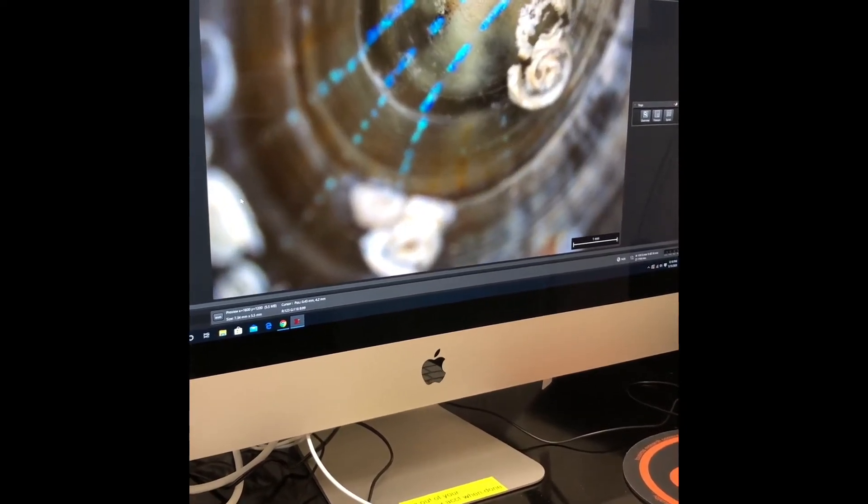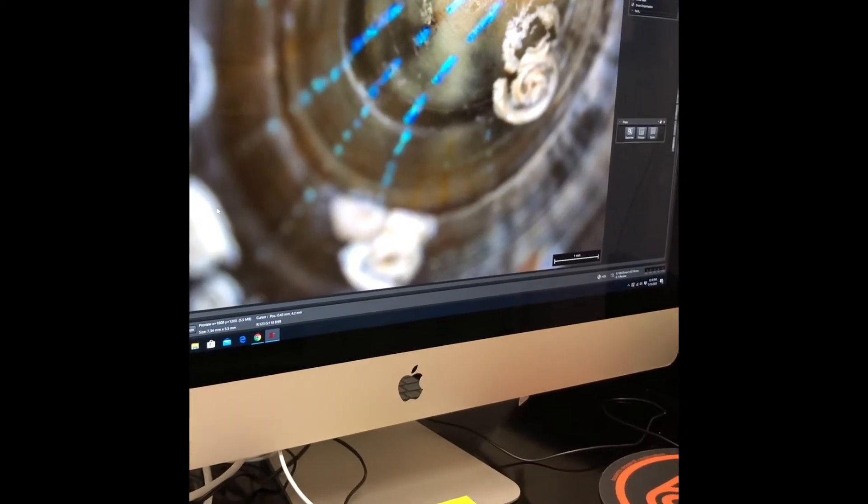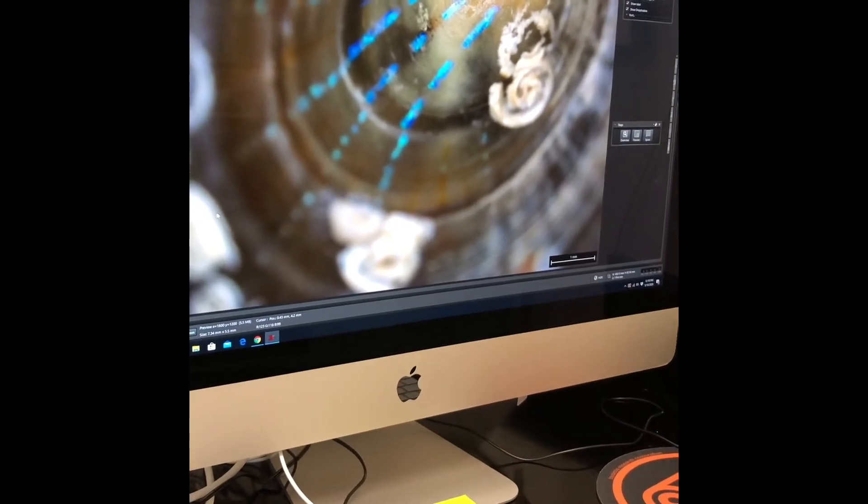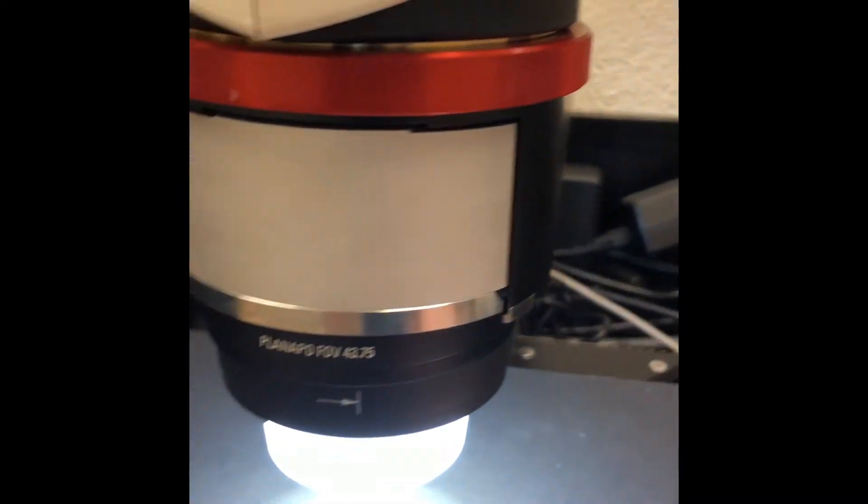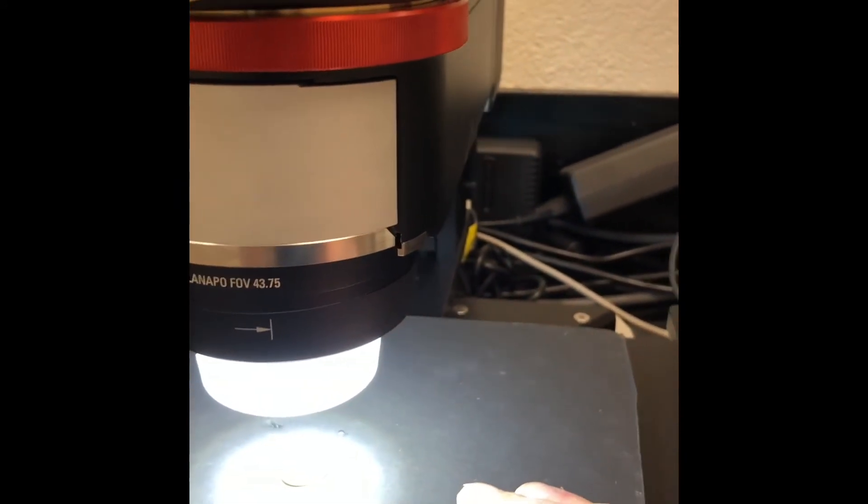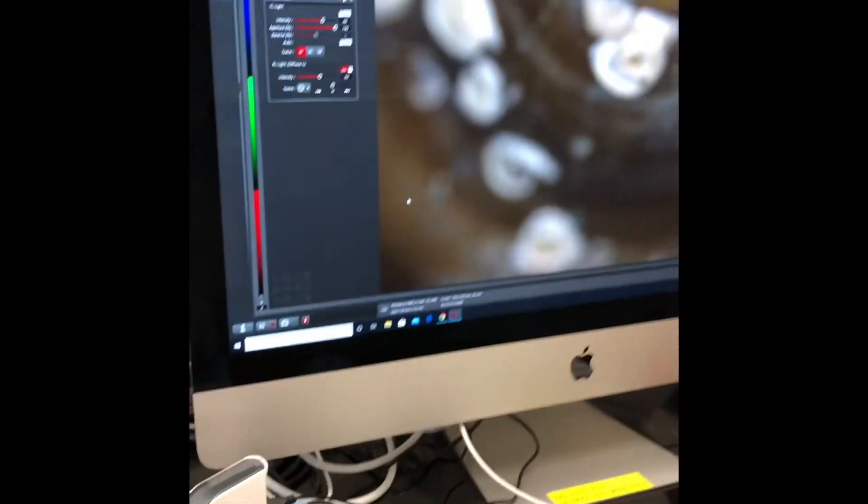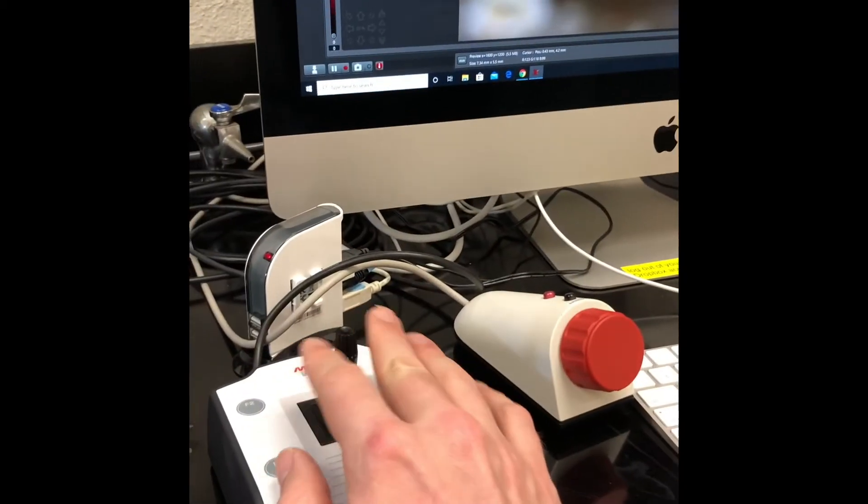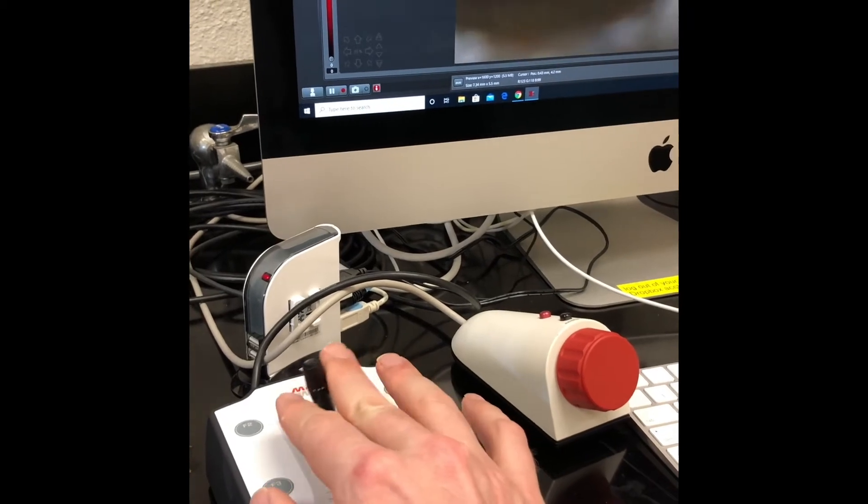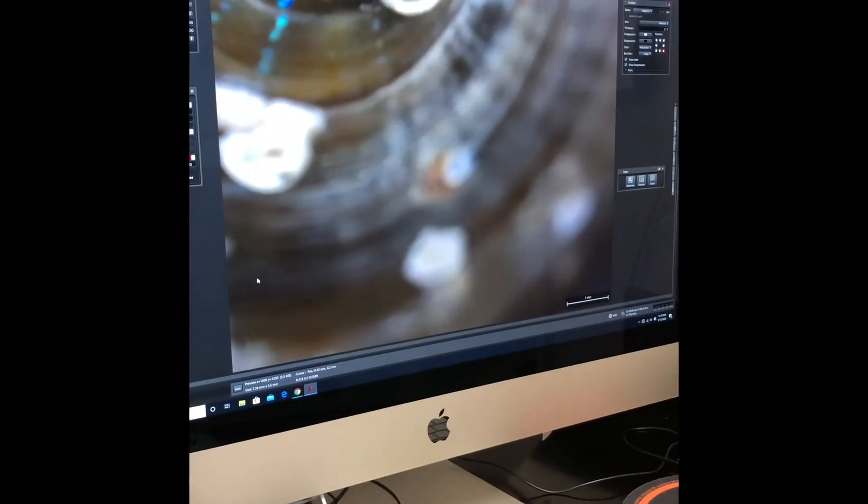We can then center our object in a couple of ways. We can physically move it around on the stage. We can use the joystick to move it around.